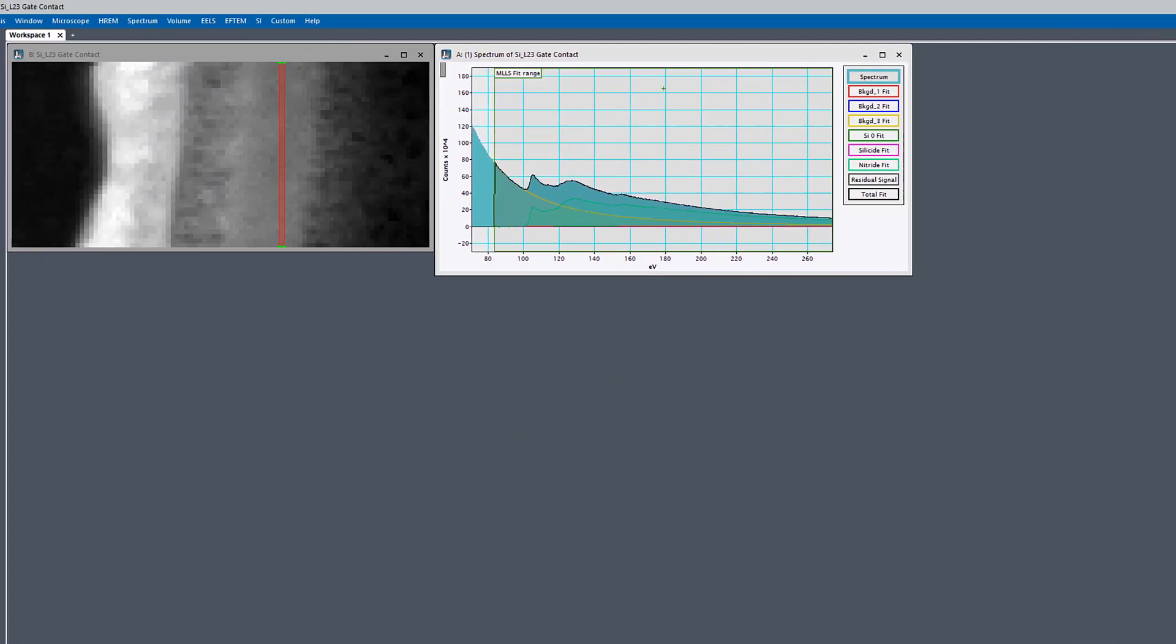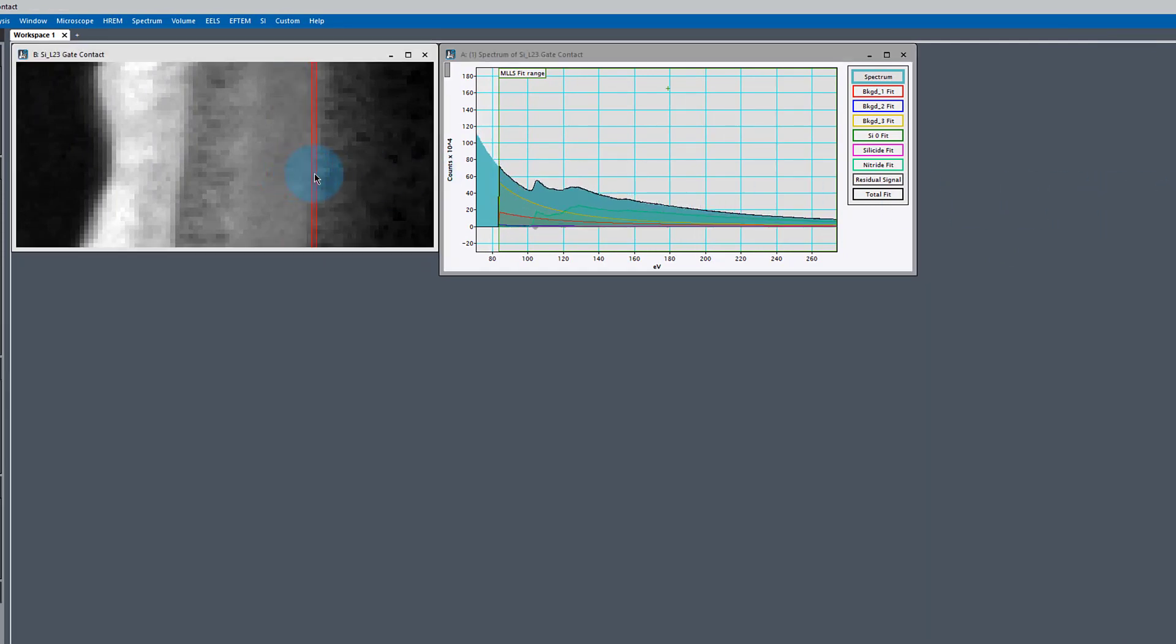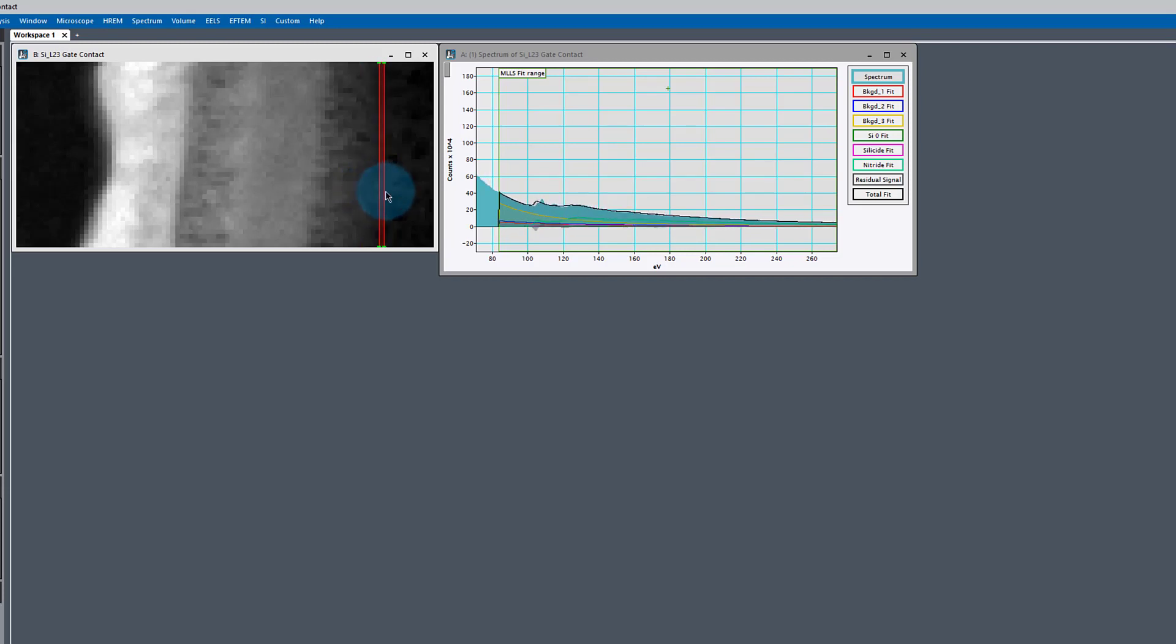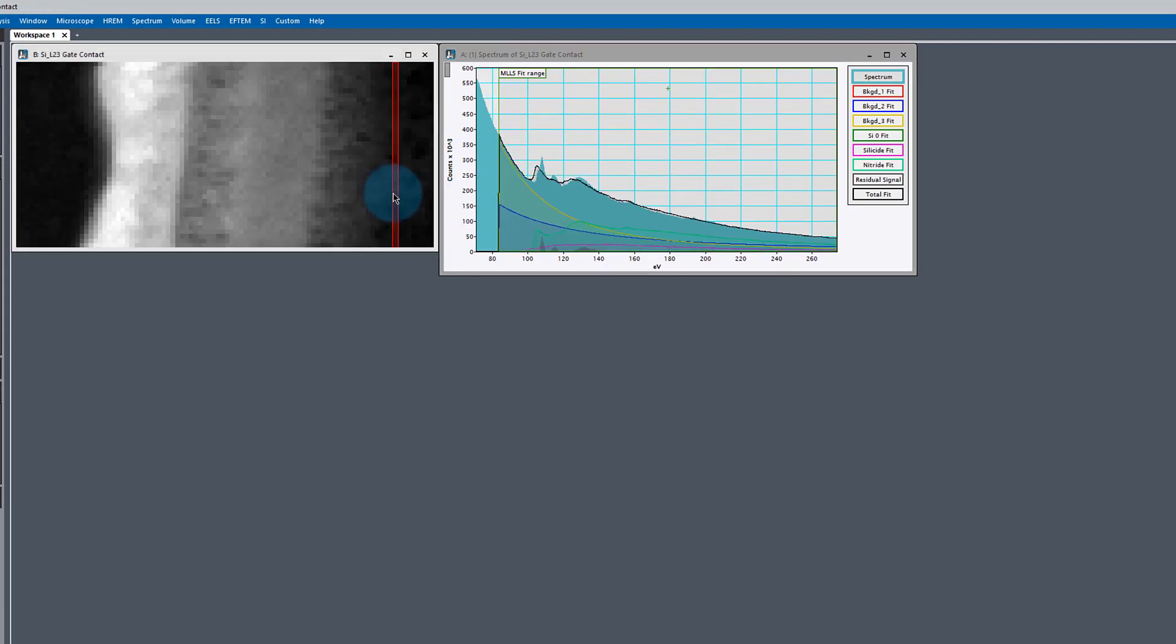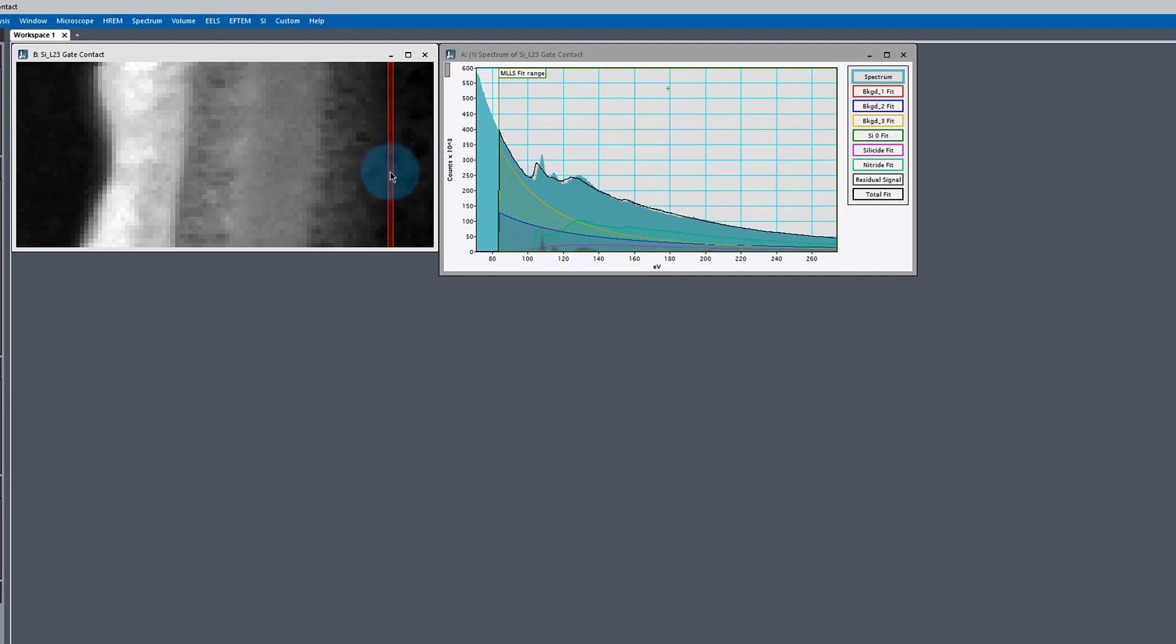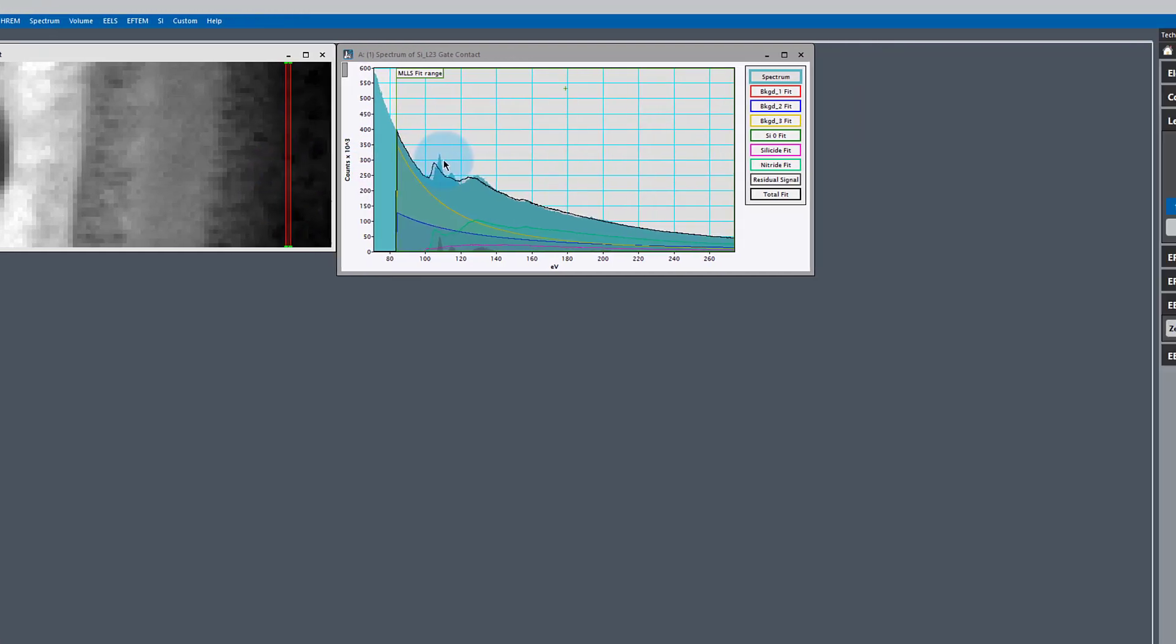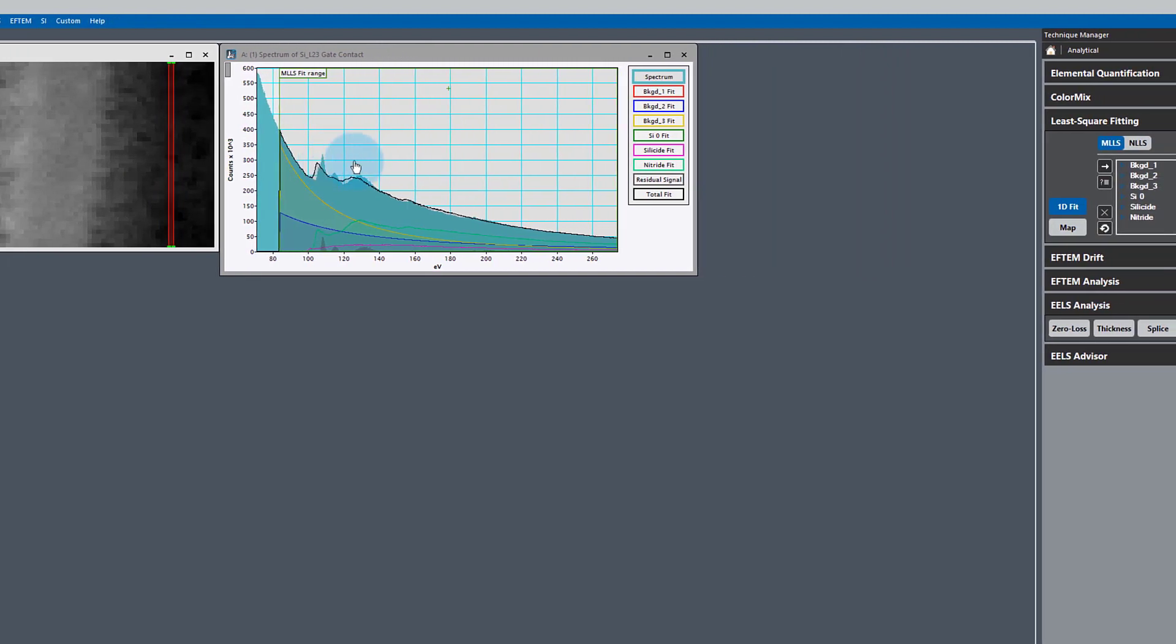Turn the fit back on and sure enough, we've got a nice fit. If we scan along some more, we see again, we get another region where our edges don't fit so well. But our background is fitting quite well. So our background is well represented here, but we need something else for our edge structure. We need a fourth reference.